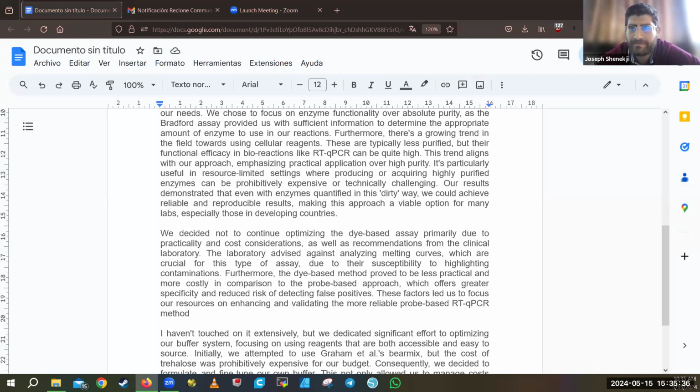Some patents said that it could provide long and durable stability for at least 2 years at room temperature or in a fridge, because some countries don't have electricity to have minus 20 all the time, and cold supply chains don't have the means to have this constant minus 20. So I'll be happy to share once I get these results.